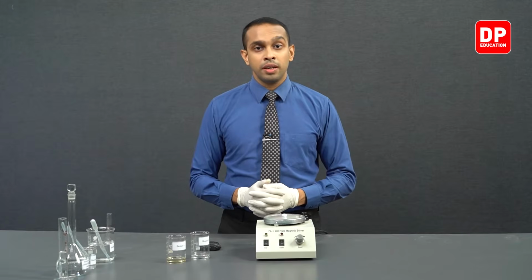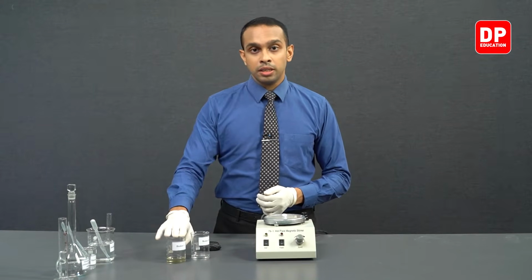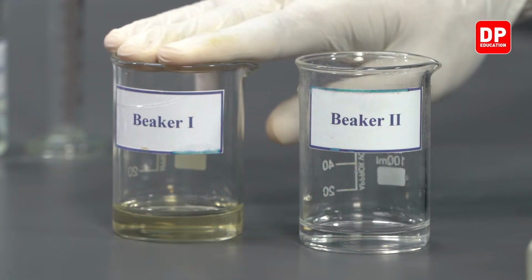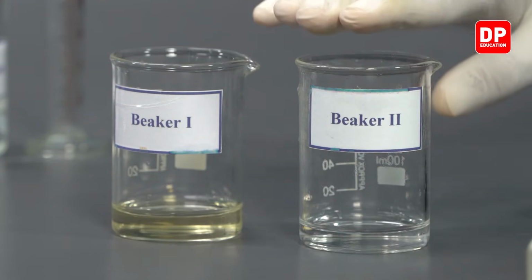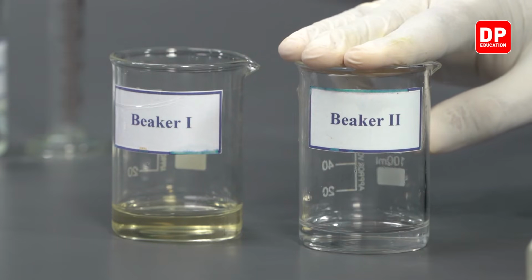Now students, we are in the third reaction. So in the third reaction, we have taken a volume of 15 cubic centimeters of acidified Fe3+ ion solution, and into this beaker 2 we have measured potassium iodide. We have measured exactly 10 cubic centimeters of potassium iodide.